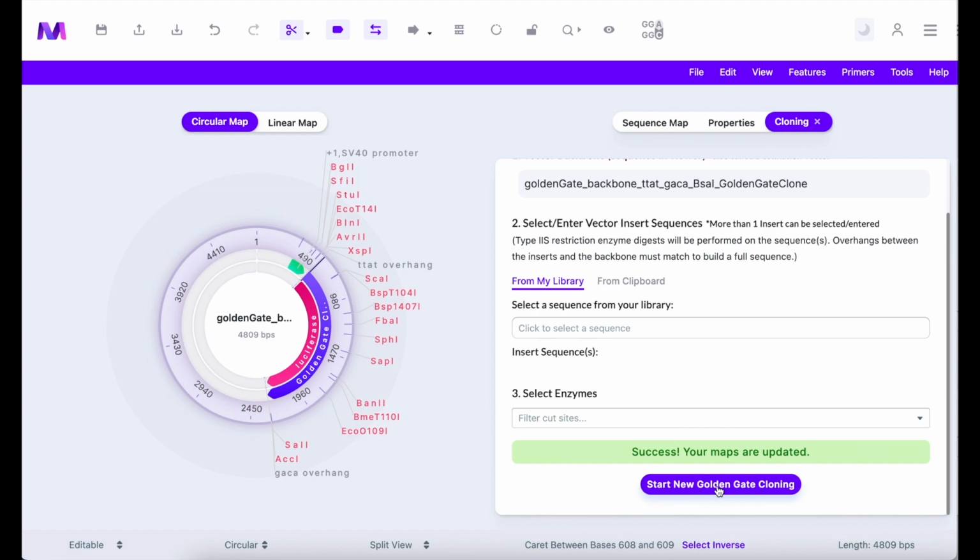Alright, cool. So our simulation has taken place, and let's make sure everything worked correctly. So remember, on the backbone we had originally this promoter site, and then we wanted the luciferase to be added after, and we see that it has right here. Okay, great. So that concludes our simulation for Golden Gate cloning on Mendelgen. Please check out our other videos to see other cloning techniques.